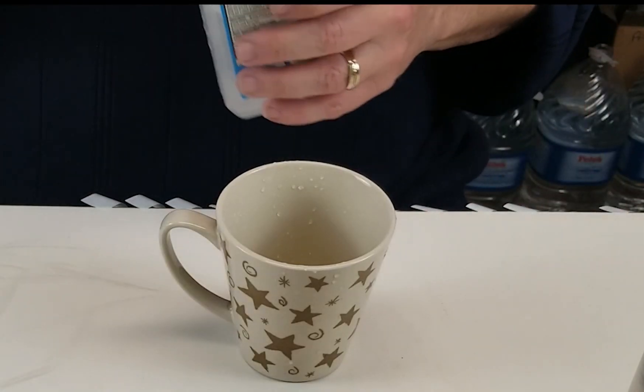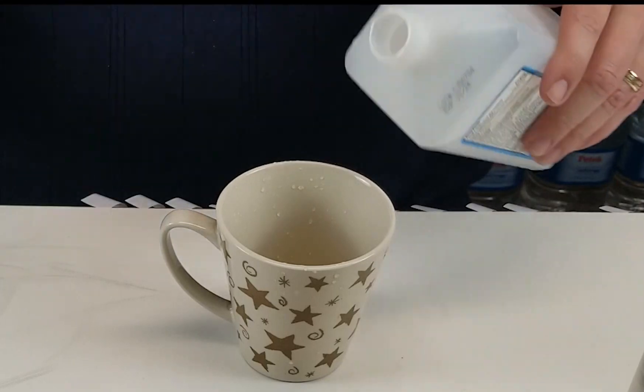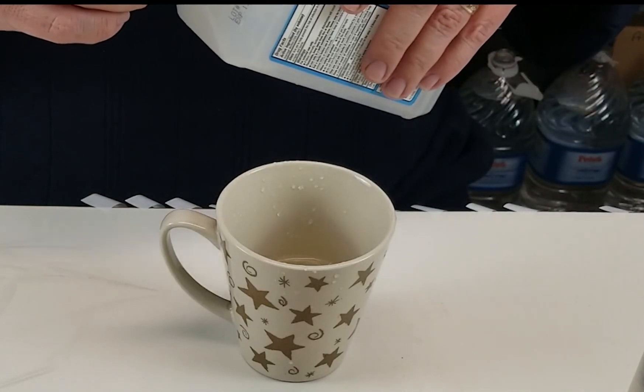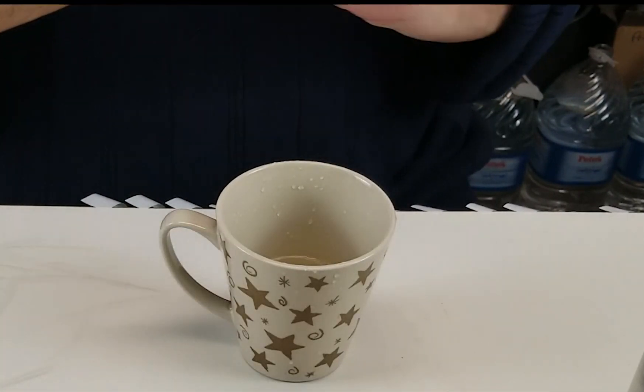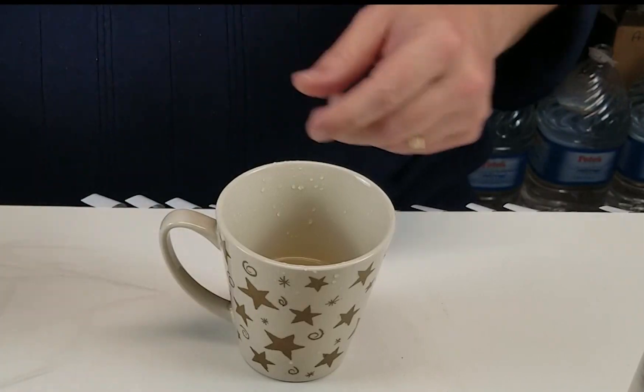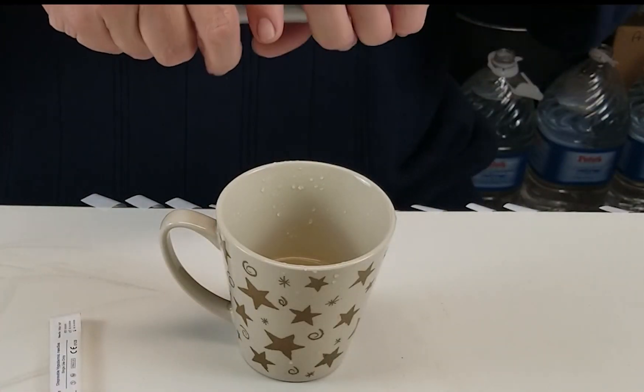Performing liquid culture inoculations. We're going to grab our 70% isopropyl alcohol and pour in about an inch worth of alcohol — usually works for me. And we'll get ready to go ahead and rinse off our parts of our syringe.